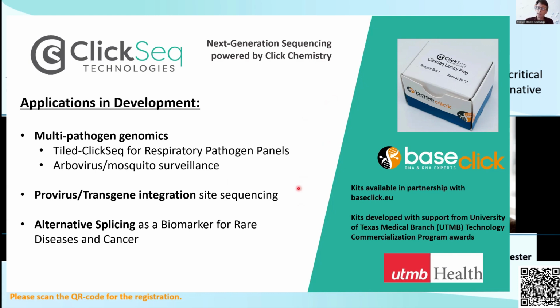And then in the lab, we're also looking at, well, why focus just on viruses? Why not look at other transcripts of interest as well that might be rare in a specific sample of interest, but where we also want to be able to resolve features such as alternative splicing or other interesting fusion events or other interesting recombination events that occur in nature.